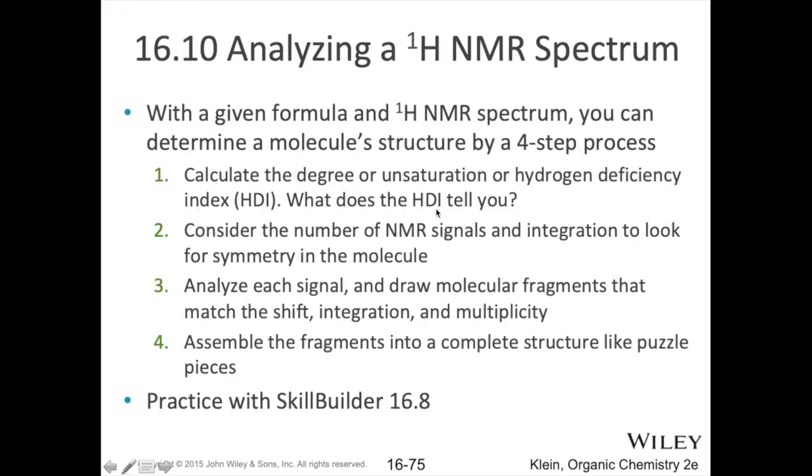Alright, so when it comes to analyzing proton NMR spectra in general, if you've got the formula of the molecule that you're dealing with, you need to look for the pieces that your molecule has, and then use your proton NMR to think about how those pieces are connected together. This is definitely an acquired skill. It takes a little practice. It takes a little getting used to. But eventually, the more you practice this, the more second nature this analytical approach to figuring out the structure of an unknown becomes.